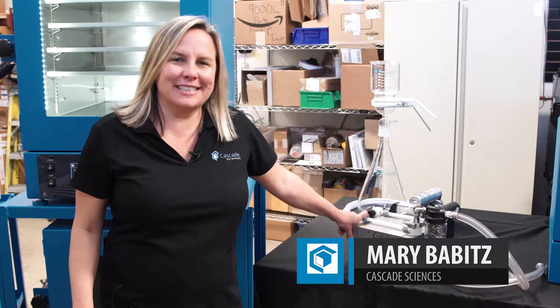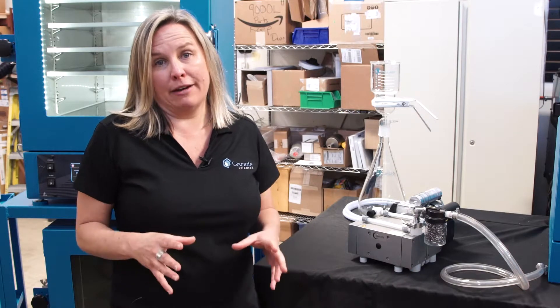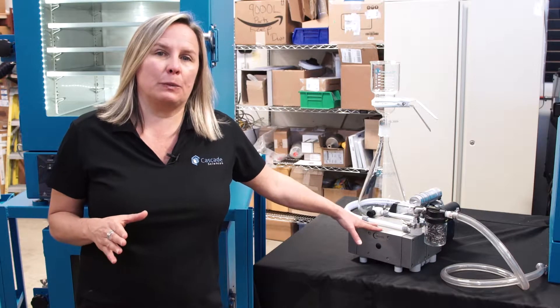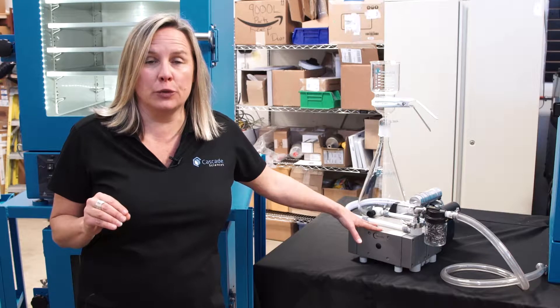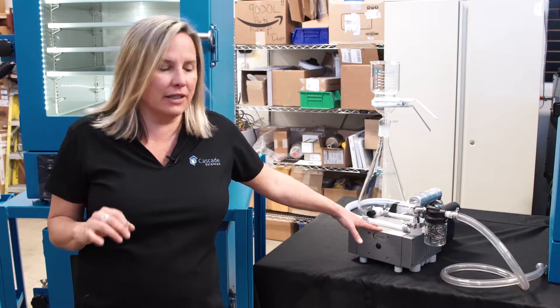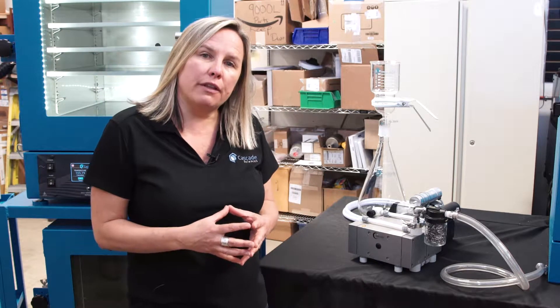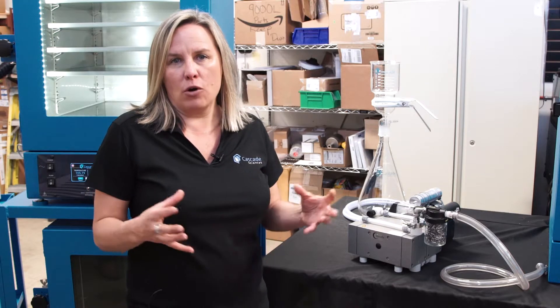Hi, I'm Mary with Cascade Sciences, and I want to take a few minutes to tell you about a really great savings opportunity with a very popular Welsh diaphragm pump. This is the CB2052. It is exactly the same as the Welsh 2052 with a couple extra bonuses, but a tremendous cost savings. Welsh has private labeled their 2052 diaphragm pump for Cascade.